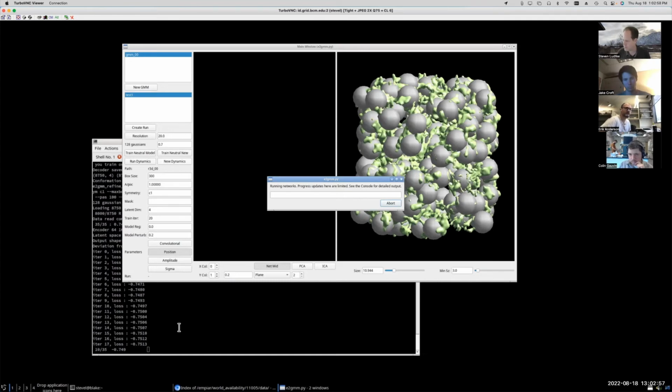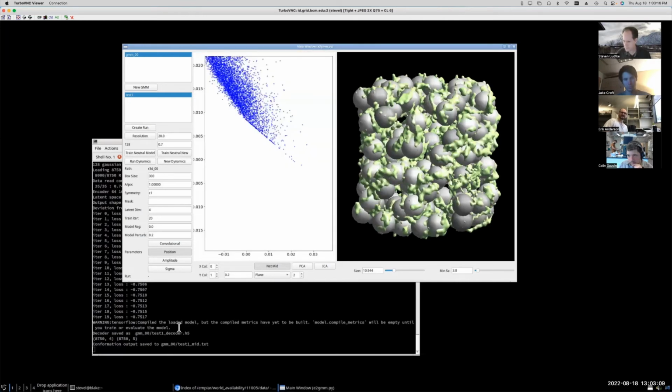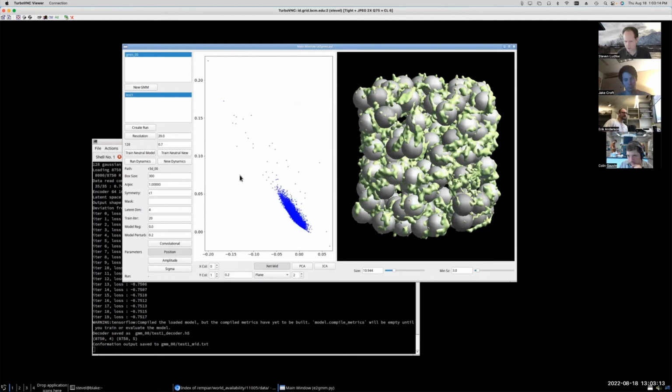Sorry, go ahead. I was just going to say, at what point do you find that the number of Gaussians becomes an issue, like RAM-wise? You said it's not an issue memory-wise anymore, but it should. If you're using the new programs, there shouldn't be a memory issue anymore.